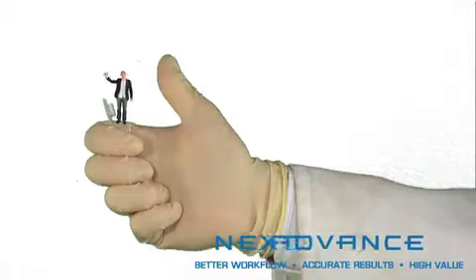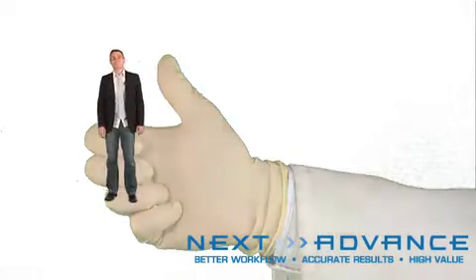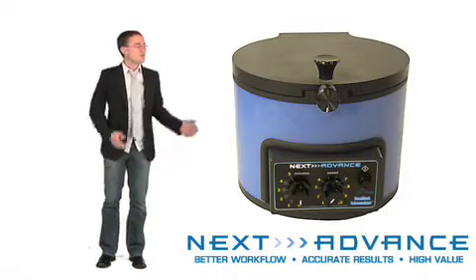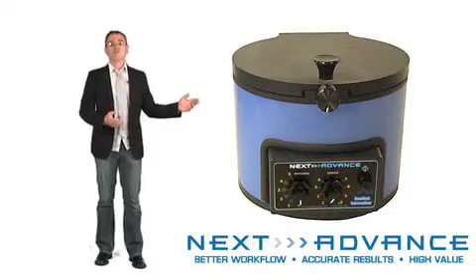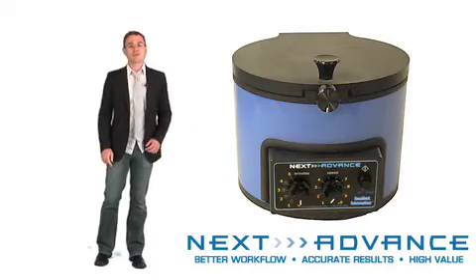Hey! Over here! Welcome! What you're looking at right now is the most advanced bench scale homogenizer out there, the Bullet Blender.